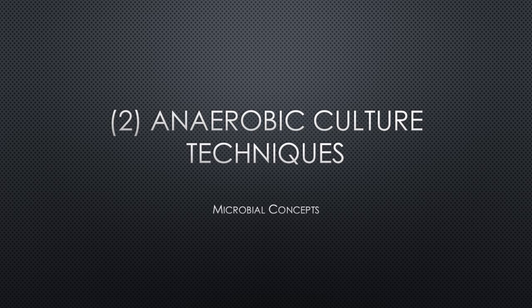Hello students. So this is the second part on anaerobic bacteria, where we are going to discuss the culture techniques which are used for anaerobic bacteria. In the first part we had already discussed the basics, some characteristics, examples, and the media which are widely used for anaerobic culturing.